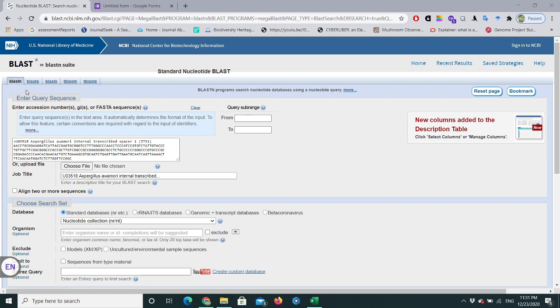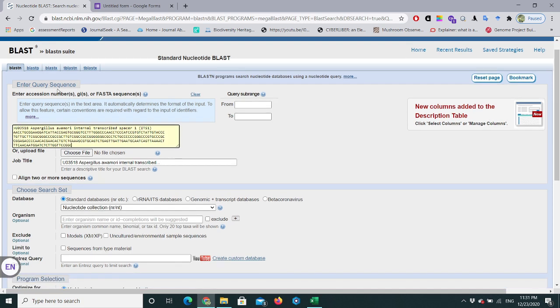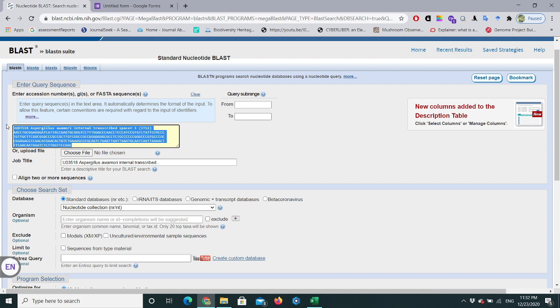If you want to find similarities between protein sequences, you can use BLASTP. On this page you can see different sections, and I'll go through each and every section, because this is the preparatory page of BLAST analysis. On this page you need to upload your input data in sequence form. You can see the first section: 'Enter Query Sequence', and here you can see a small empty box.